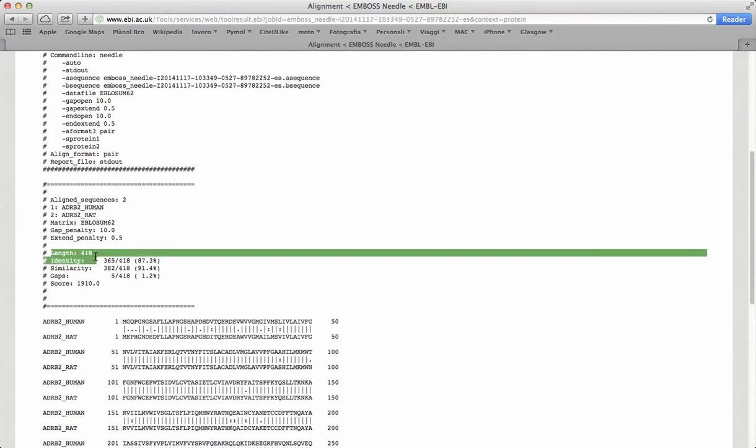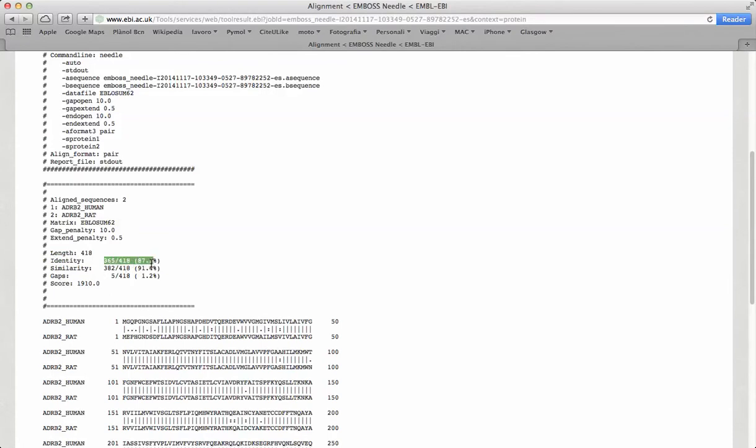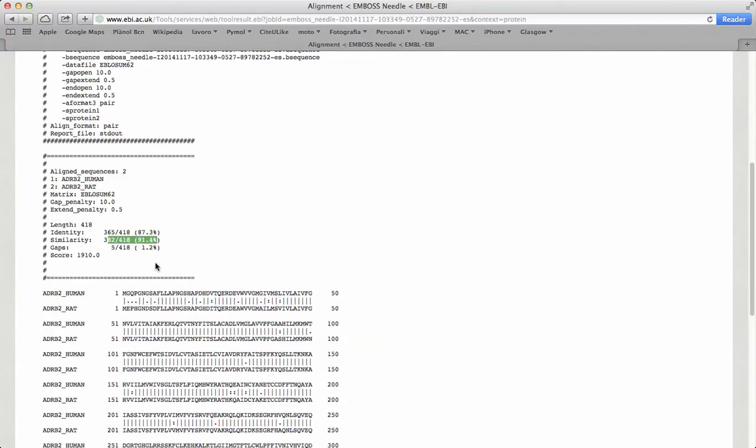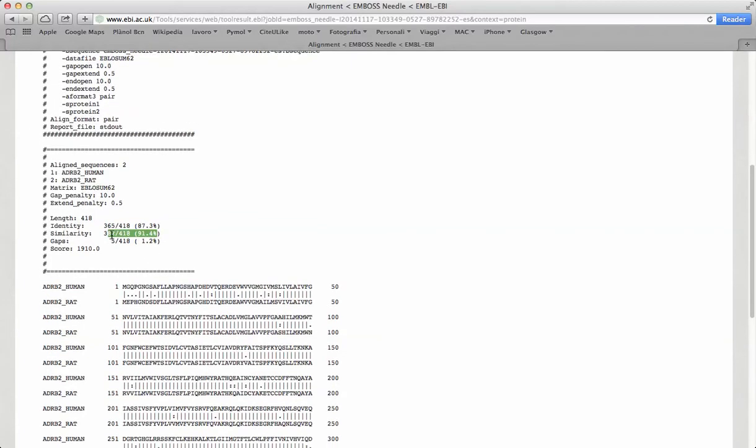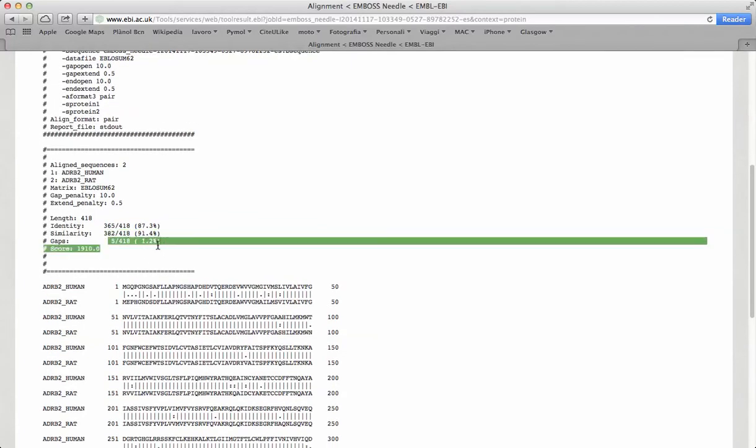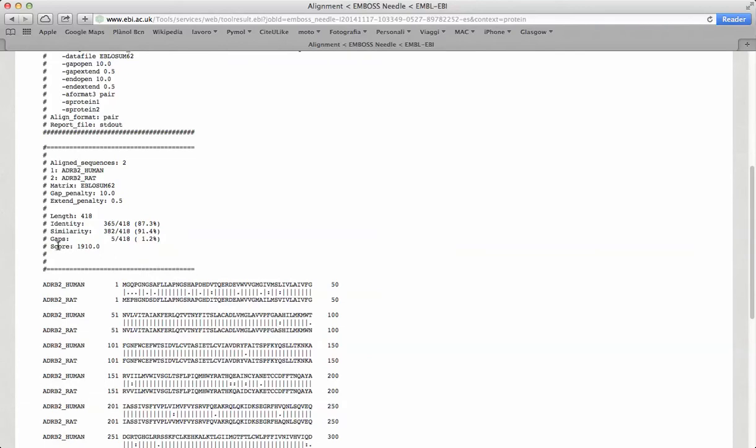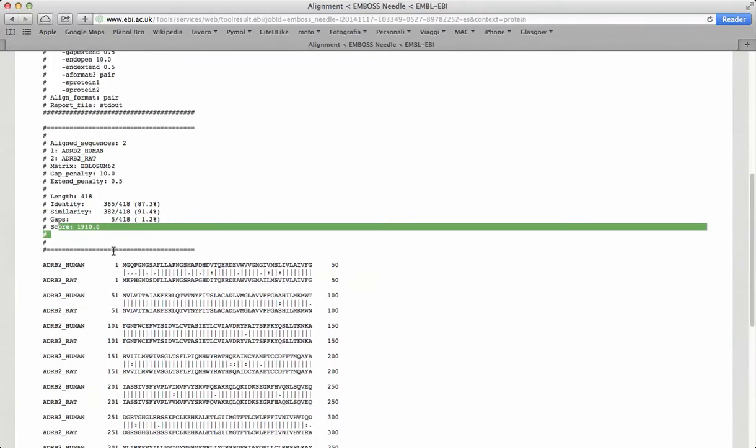Which says about the length of the alignment, the identity of residues between the two sequences, the similarity between residues, the number of gaps, and the total score of the alignment.